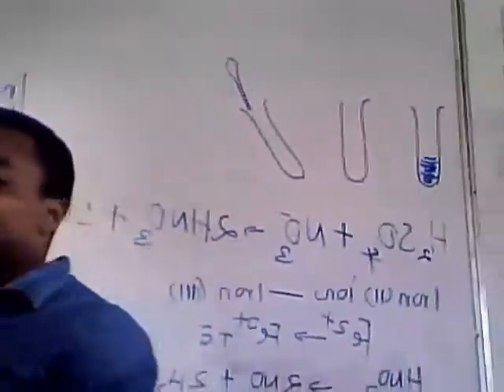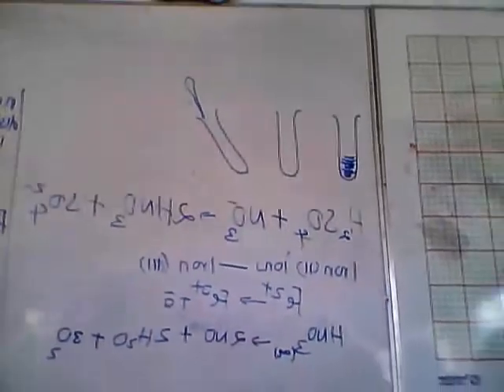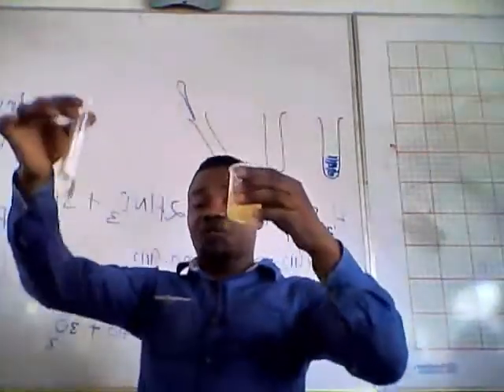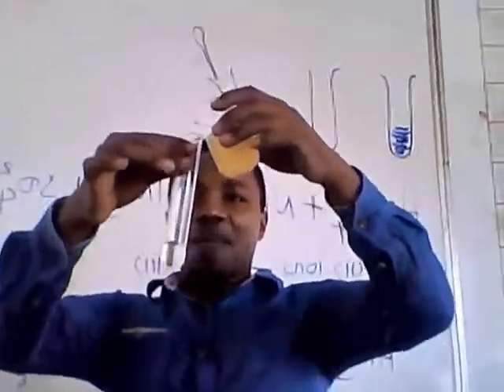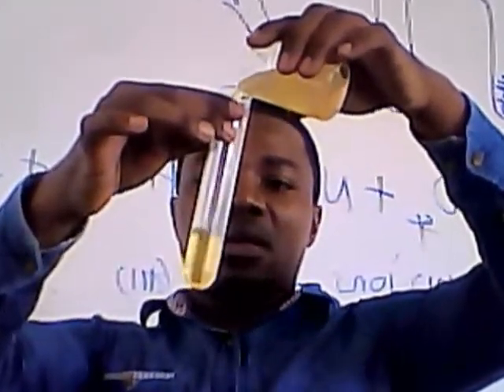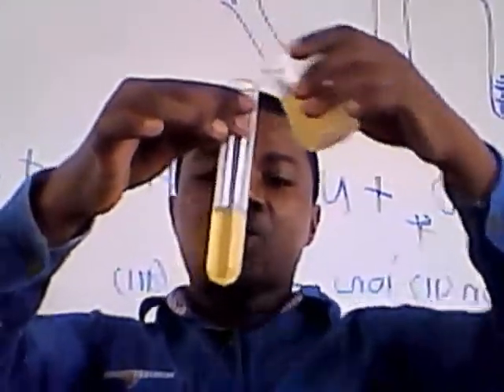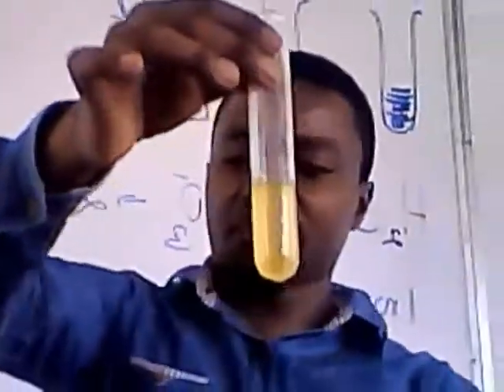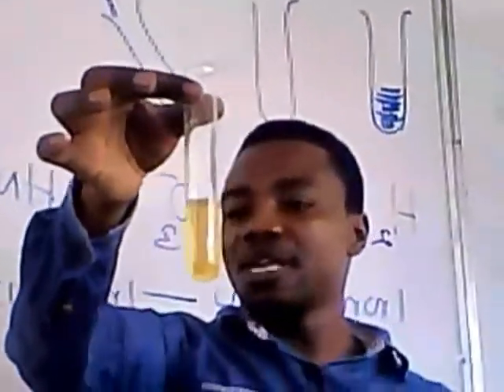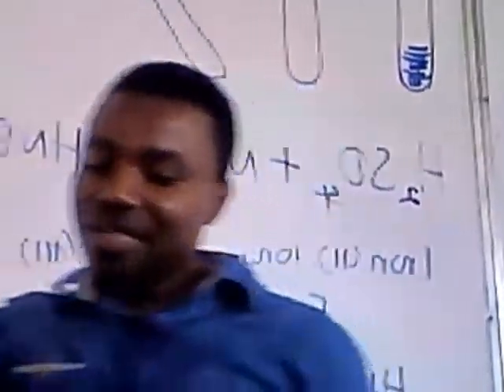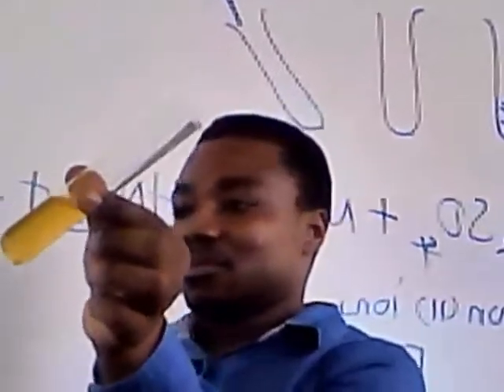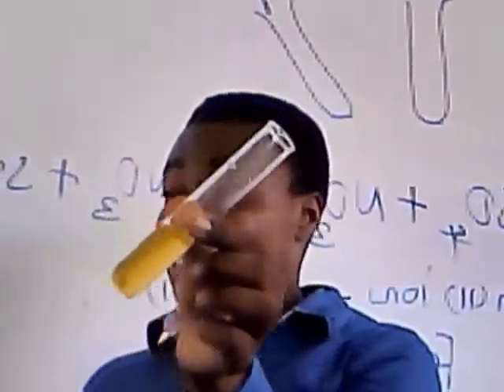Second, add freshly prepared iron(II) sulfate. This is fresh — I'm adding the freshly prepared iron(II) sulfate now. Then hold the test tube in a slanting manner.